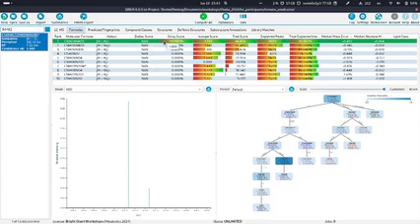You will have the SIRIUS score, which is the score by which the molecular formula candidates are actually ranked. So this is a very important score. And all the scores which are part of the SIRIUS score, for example the isotope score, which tells us how well the measured isotope pattern matches with the isotope pattern that is expected by this particular molecular formula.